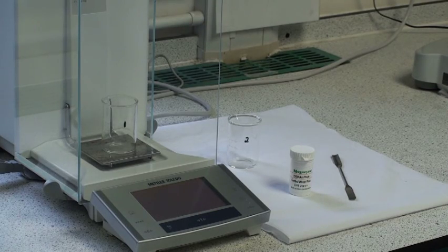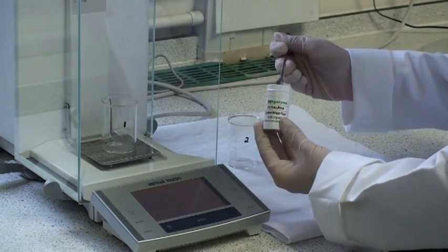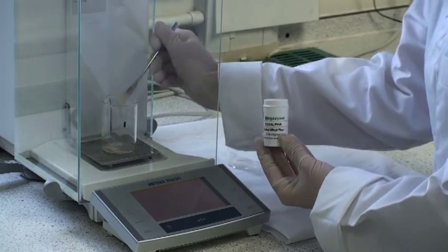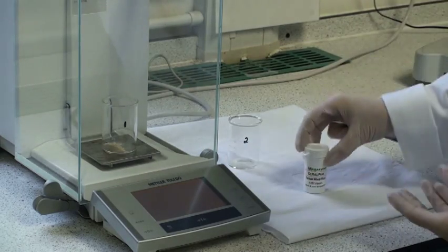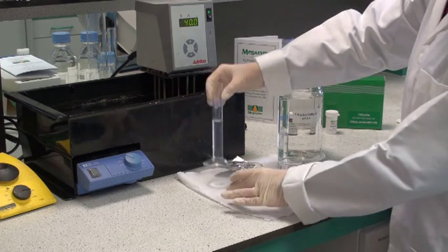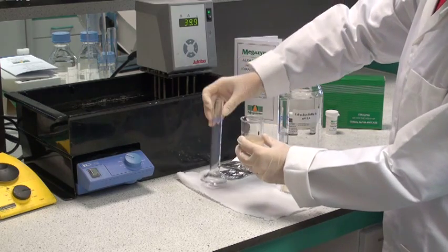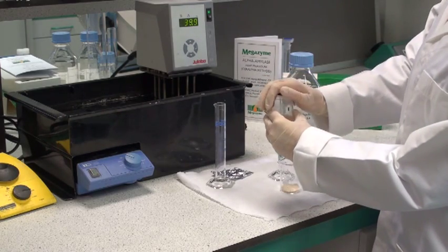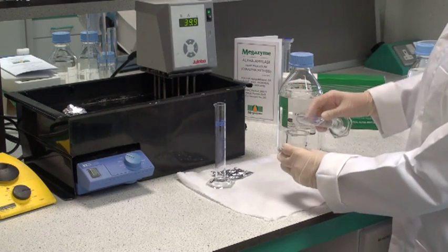For ground wheat, barley and other grains, accurately weigh 3g of the flour into a 50ml beaker. Add 20ml of extraction buffer solution to the sample. Swirl the beaker, then cover with tin foil and place in a water bath at 40 degrees centigrade where it will be incubated for 15 to 20 minutes. Repeat this operation with the second sample.